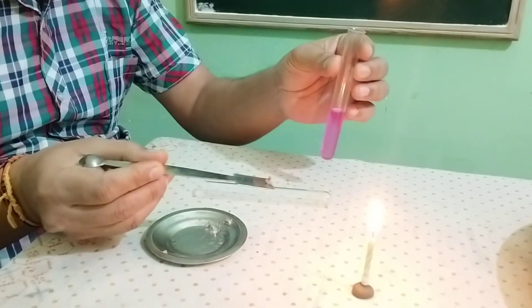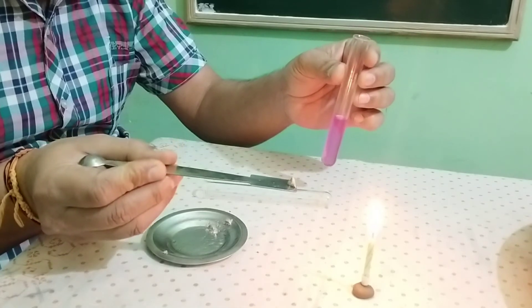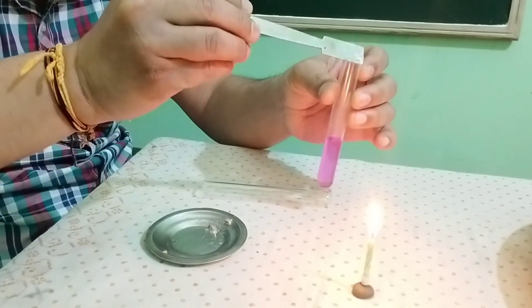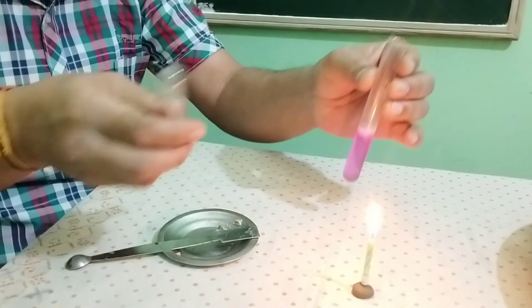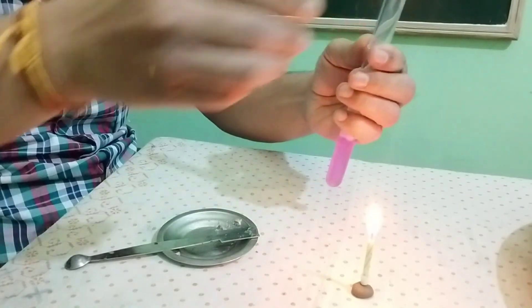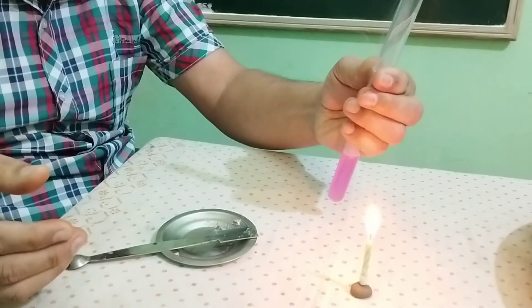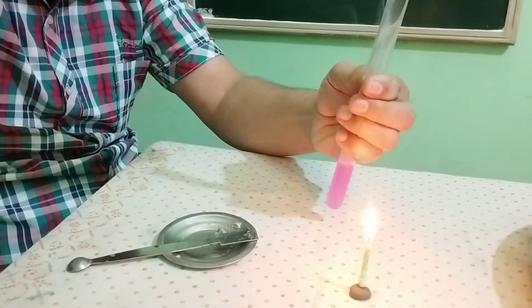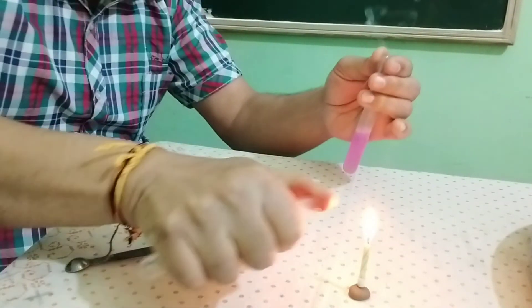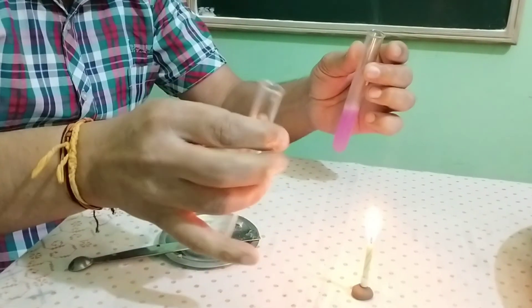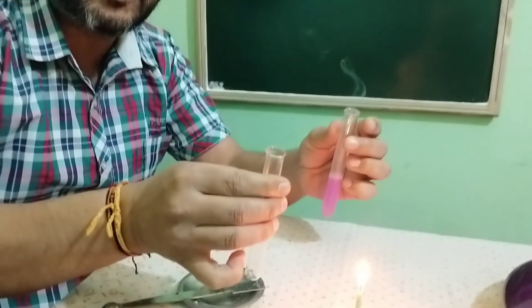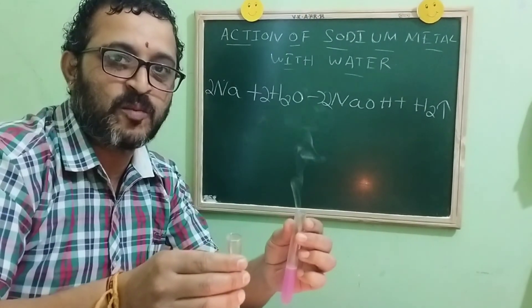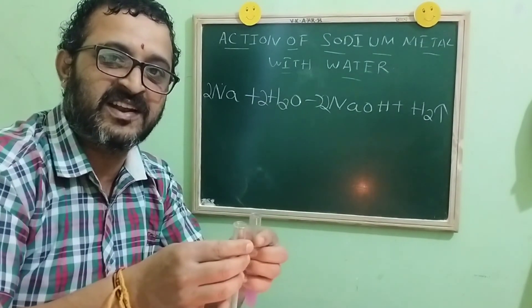I have taken a small piece of sodium and I am going to add it into a test tube containing water. The liberation of hydrogen starts, and I am going to collect this hydrogen gas in a test tube. How do you confirm whether this gas is hydrogen? This pop sound indicates that there is a liberation of hydrogen gas. Hope you have understood. Thank you, children. Namaste, everybody.